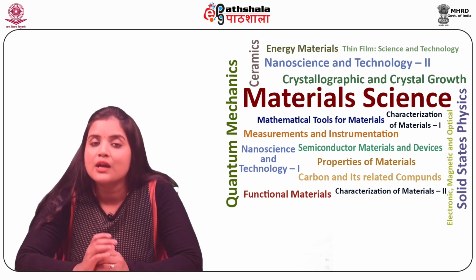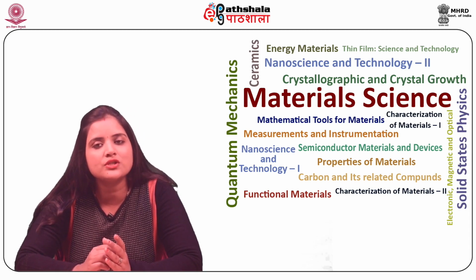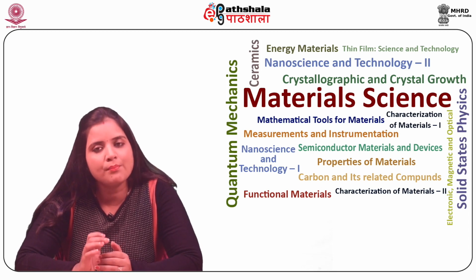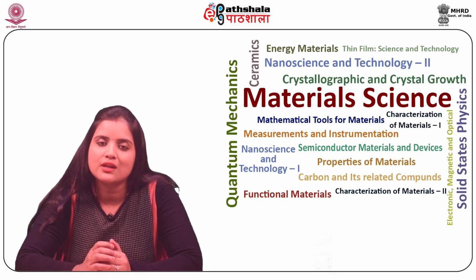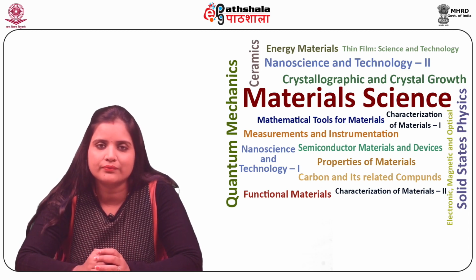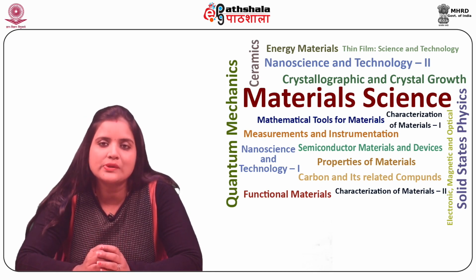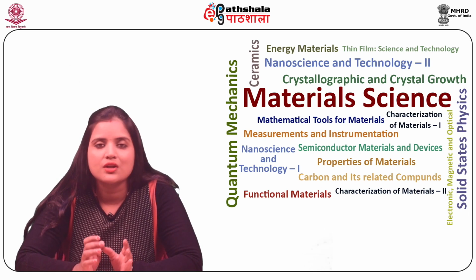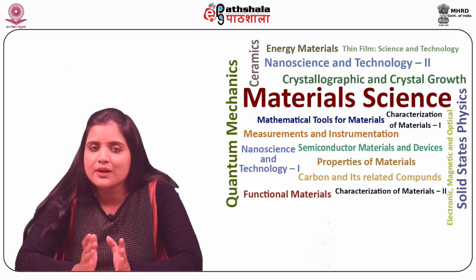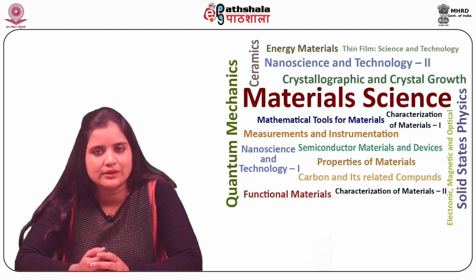Fluorescence microscopes create enlarged pictures of fluorescent light emitted from excited molecules of a sample by employing special filters and a specific technique of illumination. Filters used in the microscopes are configured such that they isolate and control two separate sets of excitation and fluorescence wavelengths.